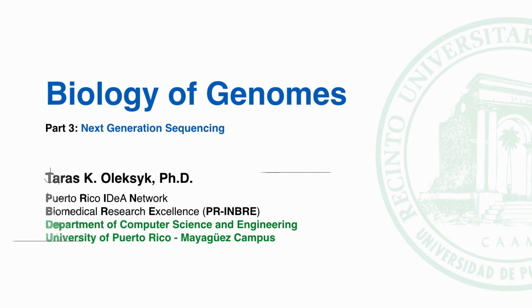Welcome to the Next Generation Sequencing lecture. One of the main reasons for this lecture is that it is crucial to understand how the data is generated in order to design genome projects, and for the downstream analysis of the sequence data.